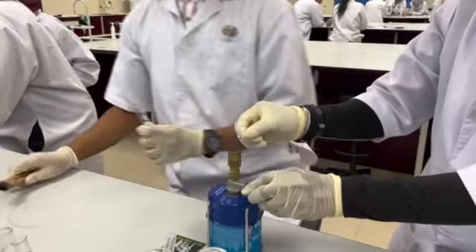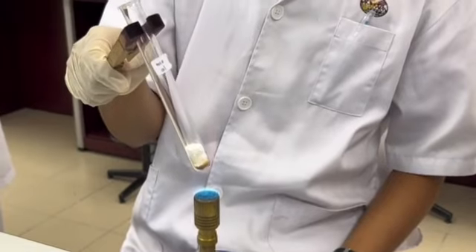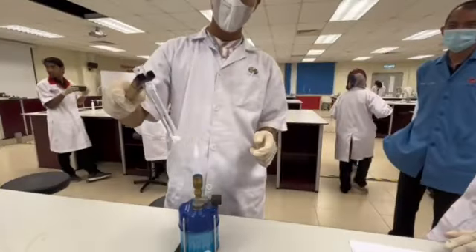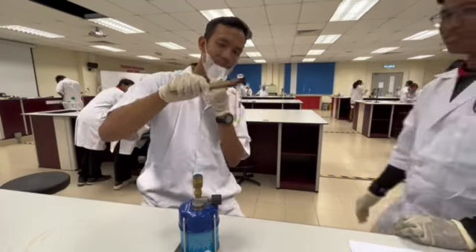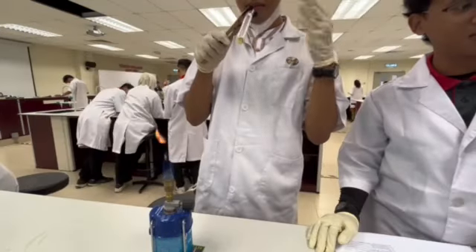The smell present for coconut oil gives a pungent smell. The smell present for vegetable oil does not give a pungent smell. The smell present for palm oil does not give a pungent smell.